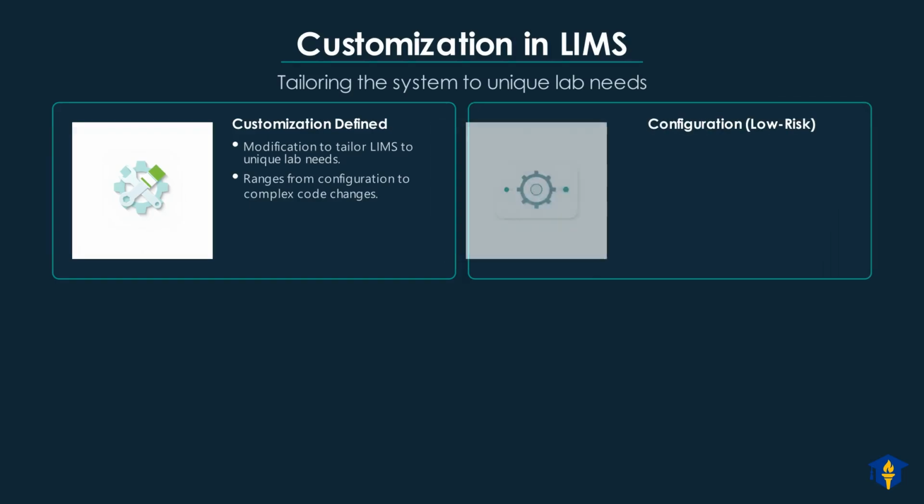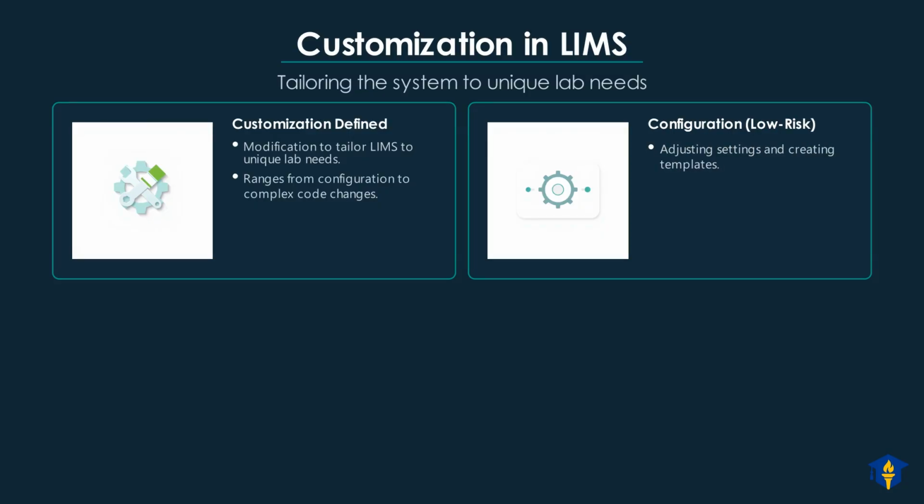The first level, configuration, is considered a relatively low-risk form of customization. This involves adjusting system settings and creating various templates to streamline operations. It allows you to easily define and standardize your laboratory workflows without extensive coding.